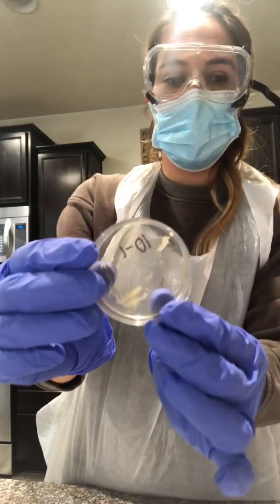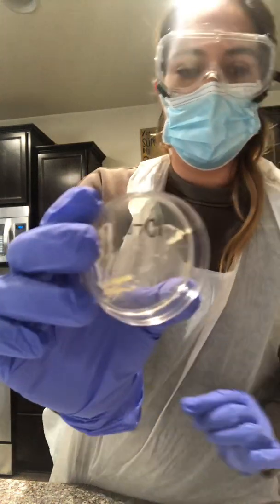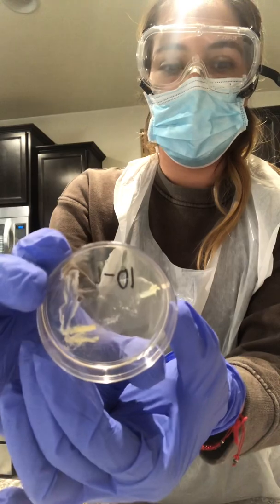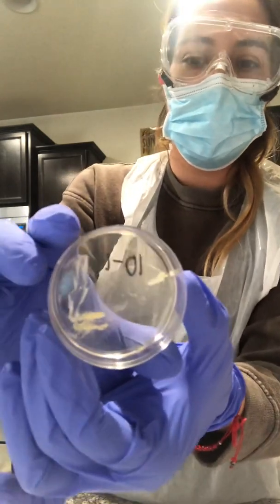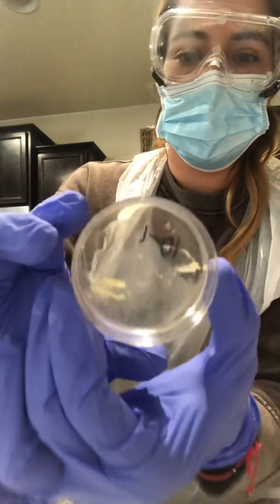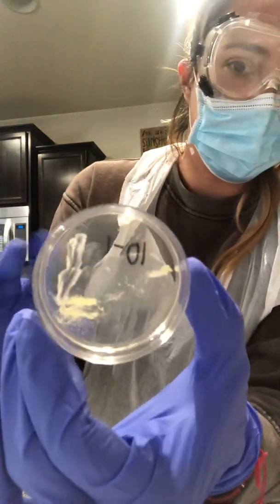For this one, I don't really see a lot of growth, and I thought because it was the first one that we put yeast and it had the most amount, that would be more viable, but it's very light in color, like a light yellow golden color.